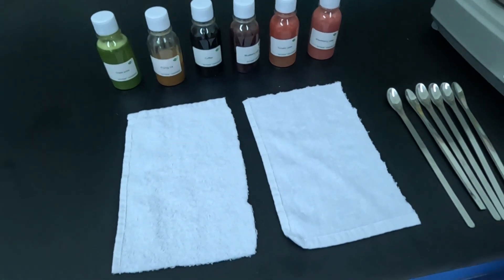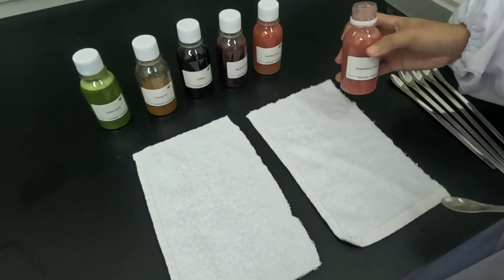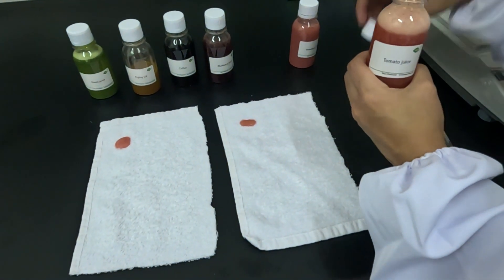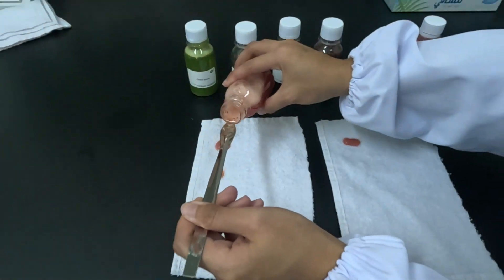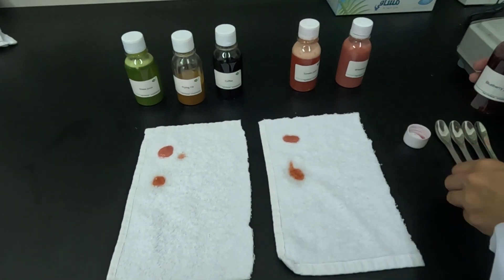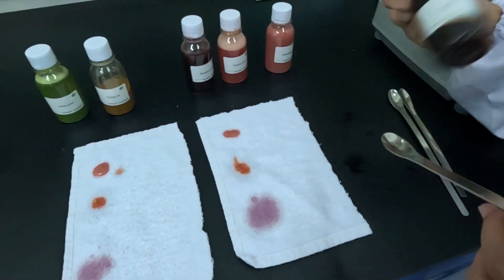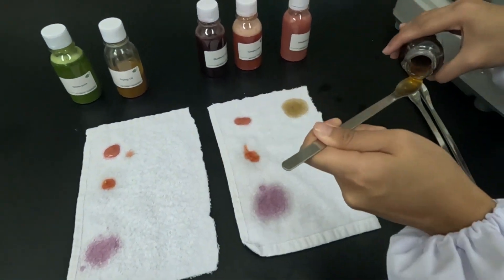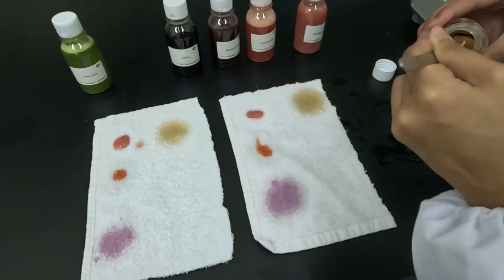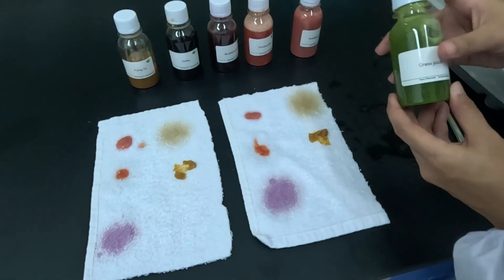The first stain will be strawberry, then tomato juice, and this one is blueberry juice, and this one is coffee, frying oil, and grass — that's the last one.